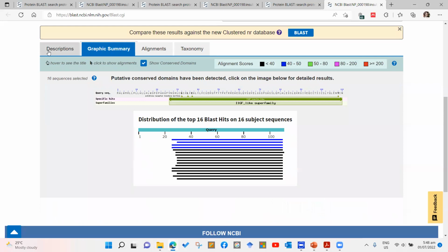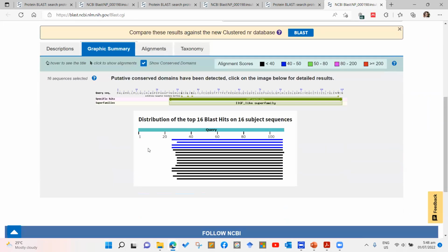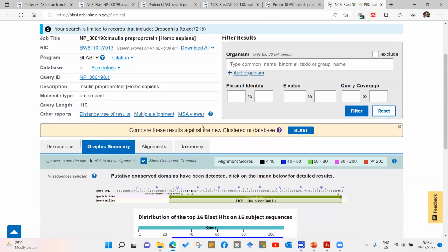So it depends on how you input your parameters; your limitations and exclusions will depend on your question. Well, we don't really specify a specific question here. We just did a somewhat random amino acid search on a random ID, just to have an example. Okay, so this is for the basic BLAST search.